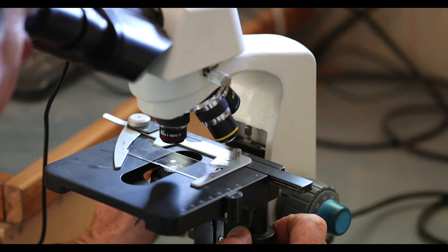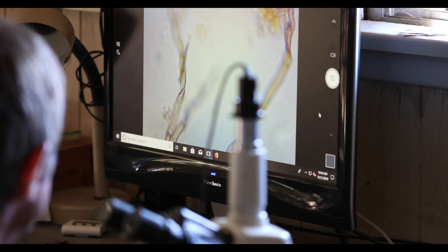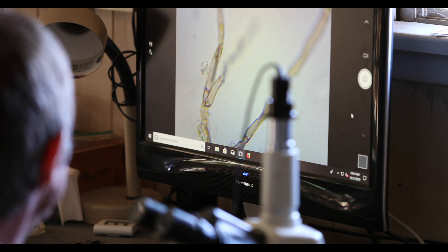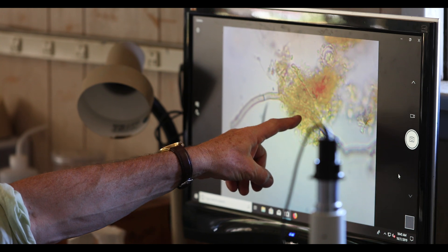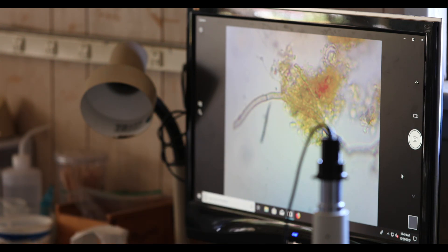I'm looking for fungal hyphae — see if I can find a nice one here. There really is a lot of testate amoeba action here. I like to see fungal hyphae. Thirty percent of the carbon in soil is actually the glues that fungal hyphae produce — glomalin — and they glue together particles of soil. Fungi and bacteria hold together soil. If you don't have that, then you don't have soil aggregates — what you've got is dead dirt. But here you can actually see an aggregate beside a fungal hyphae. It's quite broad, it's got color, it's got a cross wall right there, and it's going right through the middle of a soil aggregate which has some bacteria moving around inside.